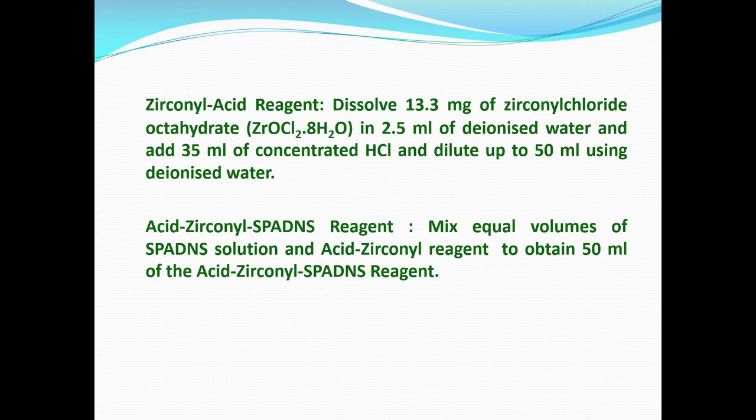All these reagents, whatever recipe I am giving you, are available in textbooks, especially the American Waterworks published book on water analysis, the APHA book it is called.